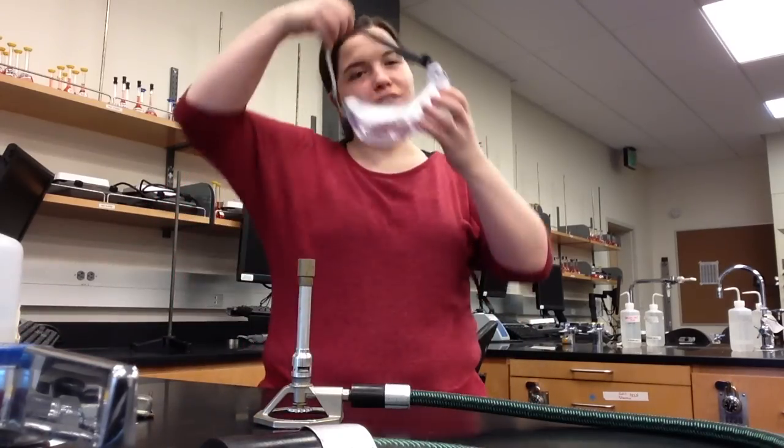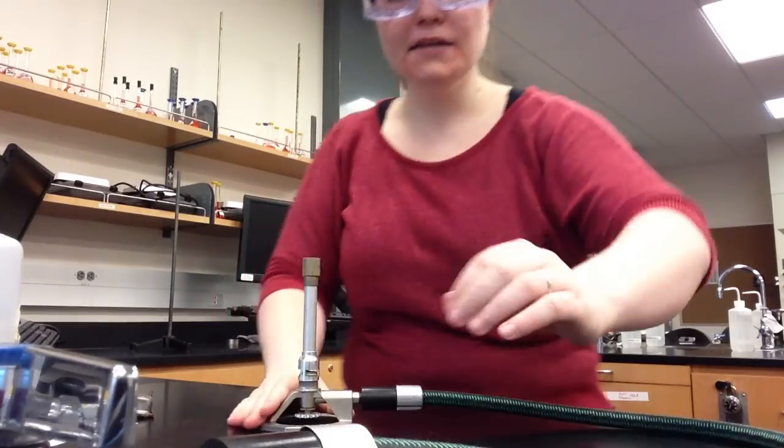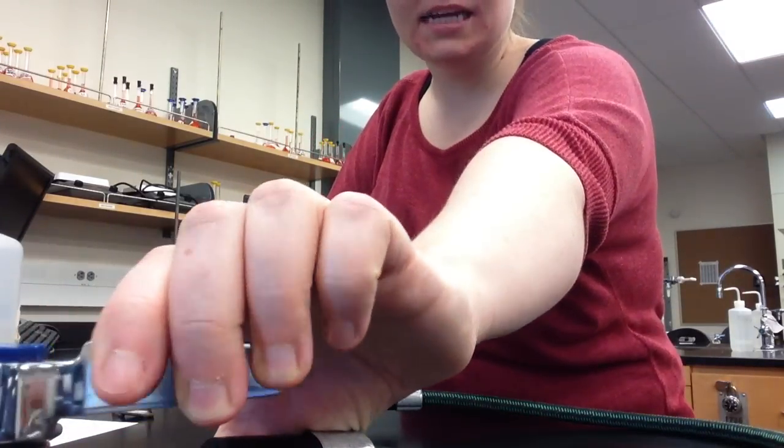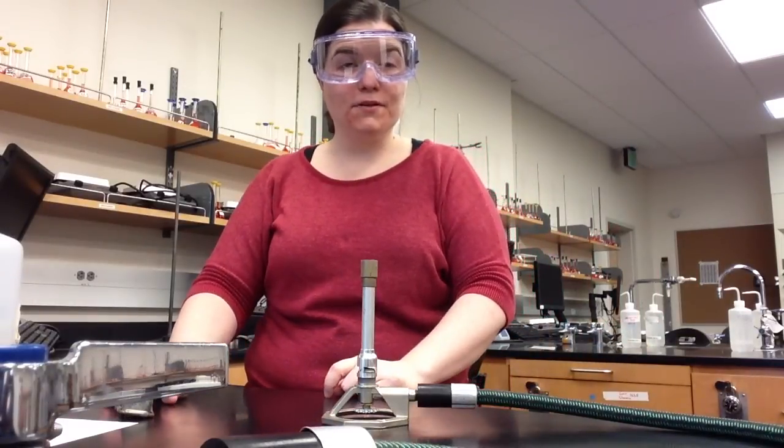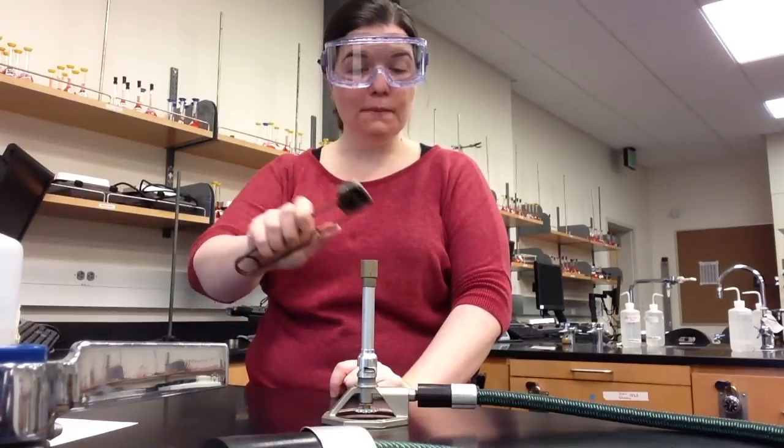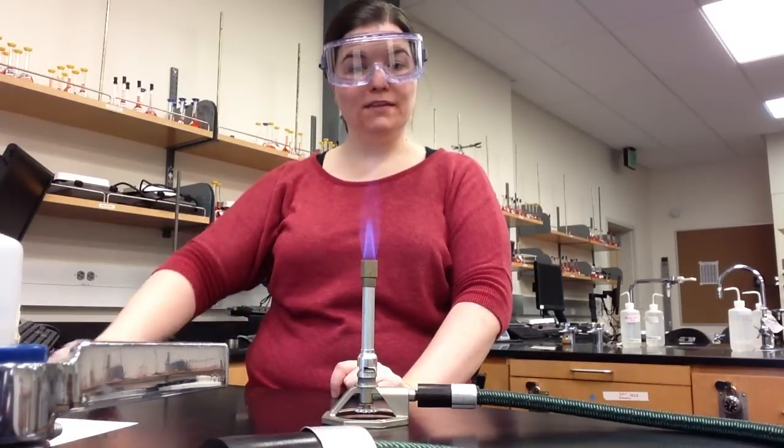I'm now going to put on my safety goggles to protect my eyes. I'm going to turn the handle of the gas valve until it is on top of the valve. When I do, I can hear gas coming out of the Bunsen burner and I can smell a little bit of it. I'm going to squeeze the striker on top of the Bunsen burner to ignite the flame.